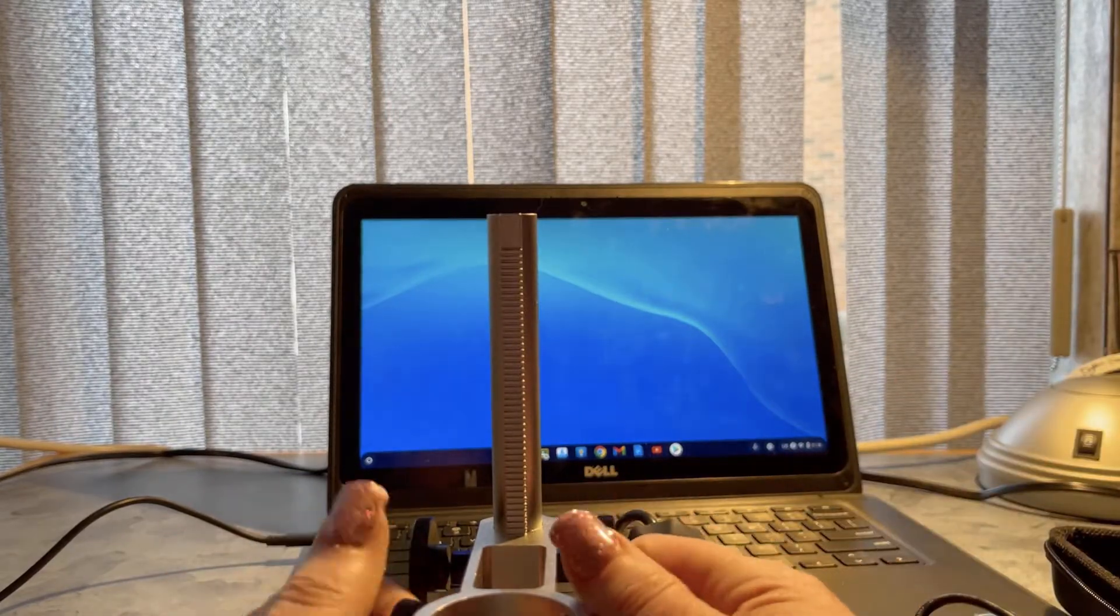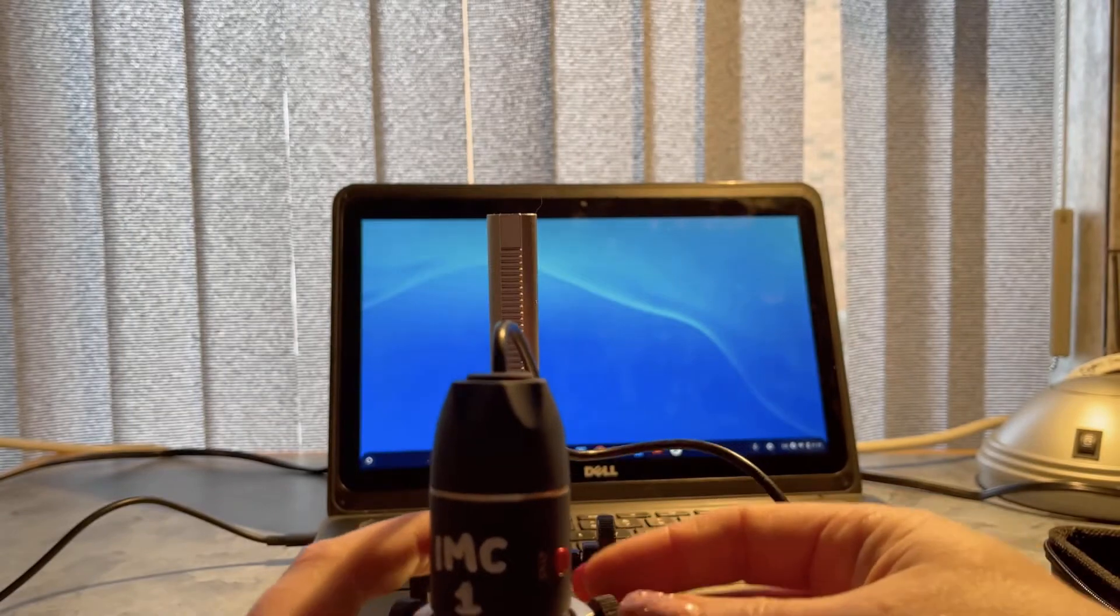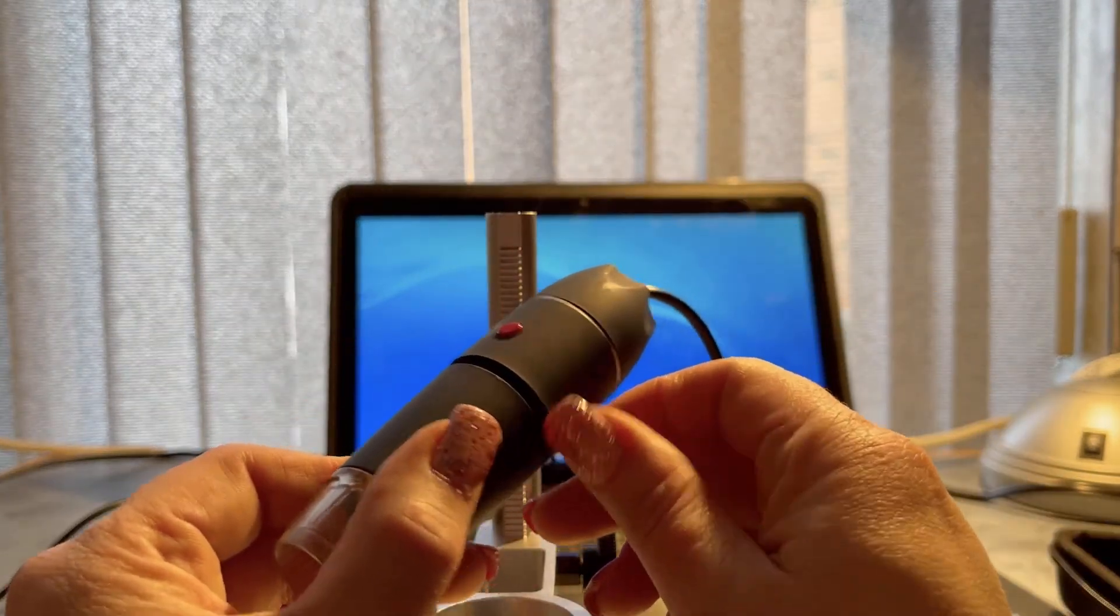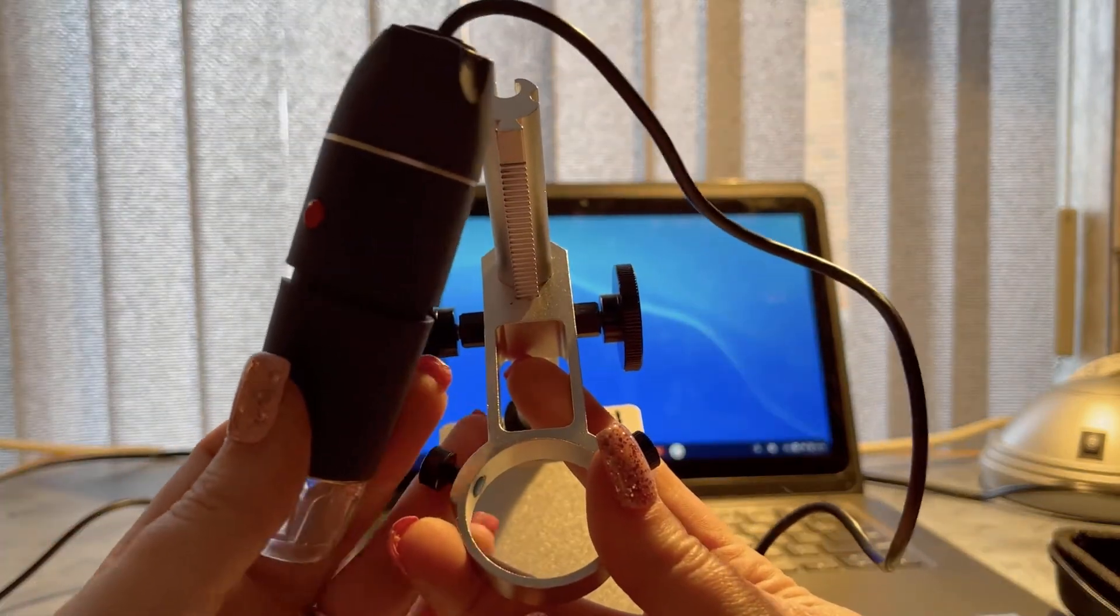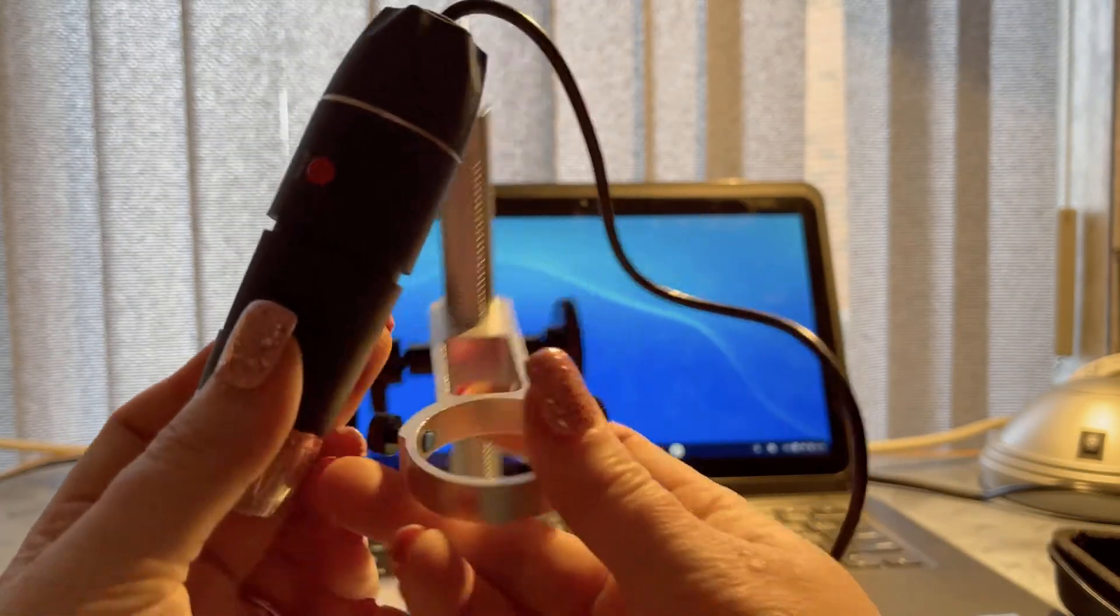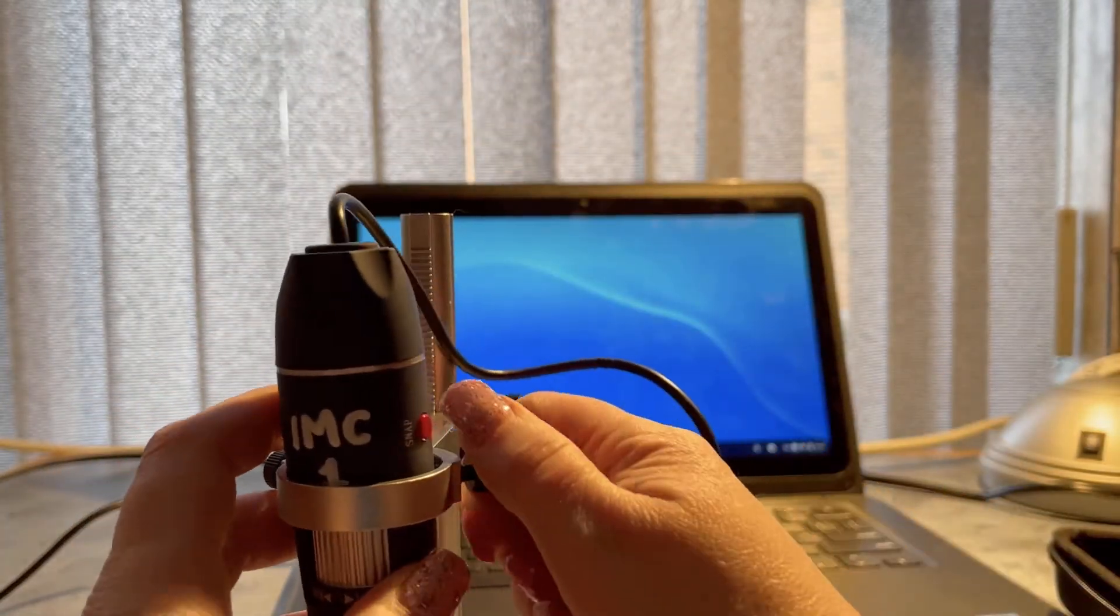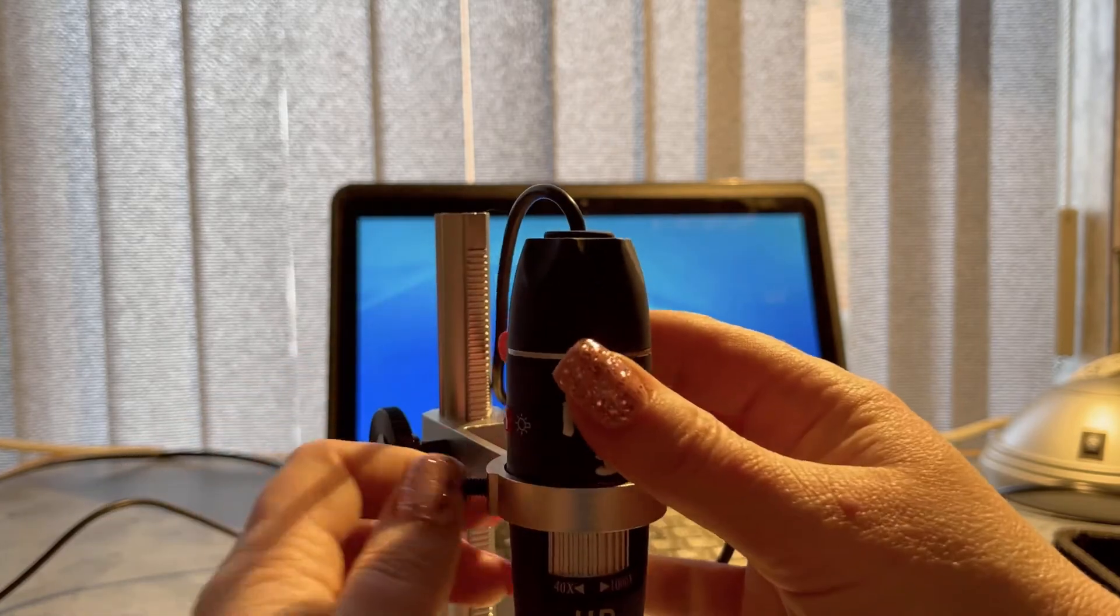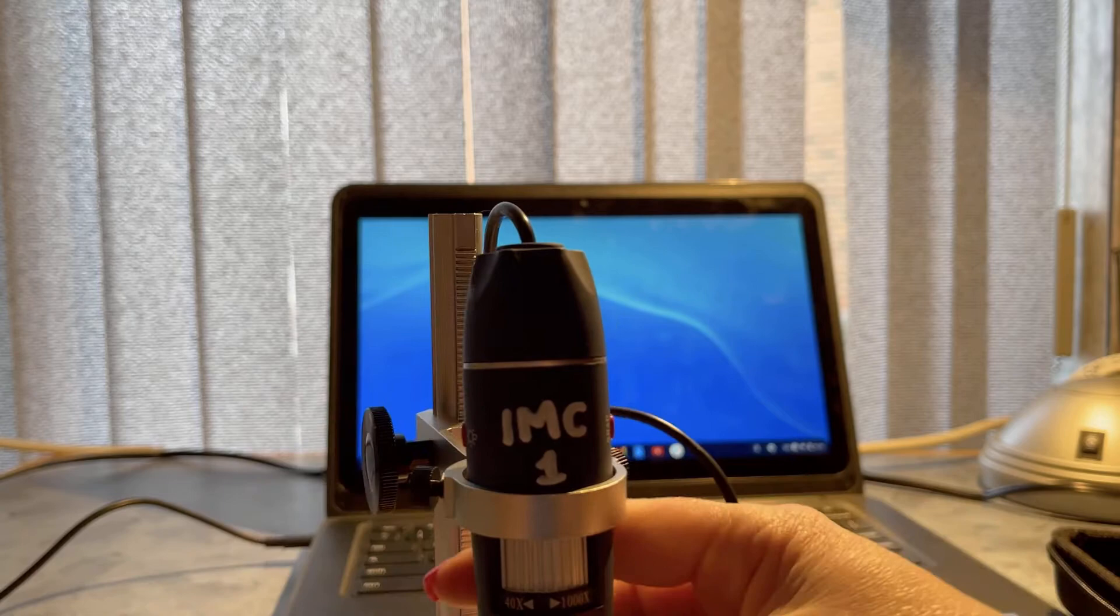I'm going to slide this in, and you'll see there's a little groove here. These screws in the stand will screw into that ridge to hold the microscope firmly. I'll get it approximate, then start screwing one until it clicks in, then tighten it but not too tight. There we go, the microscope is connected into the stand and ready to use.